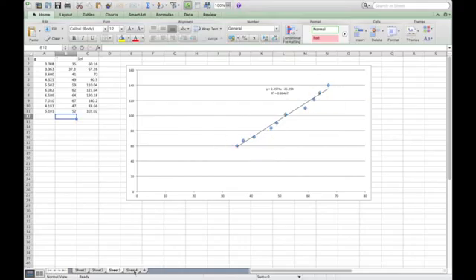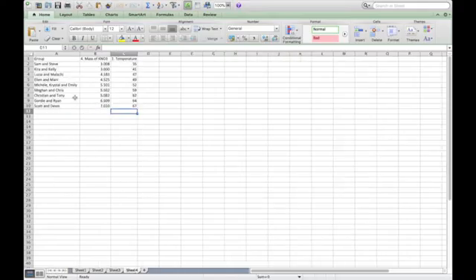So feel free, like I said, to take any of these data points. You don't really need the names. I think I kept them for that group back in 2015, just so we could see whose data was what. But just copy down the mass of potassium nitrate and the temperatures for any of the data points that you randomly choose.